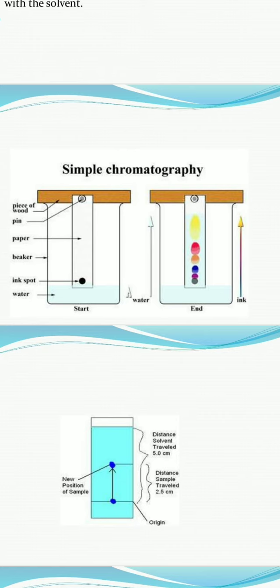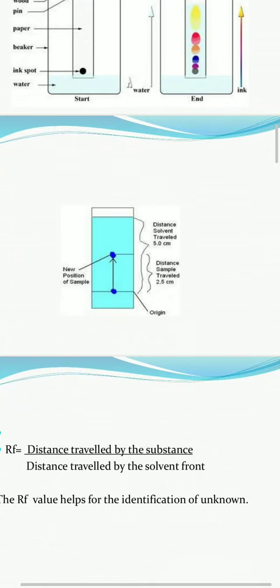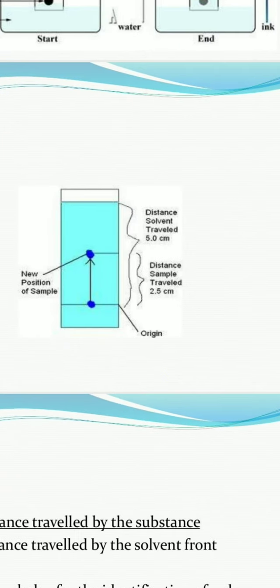The mobile phase travels through capillary action, and on this basis the sample containing the mixture in this spot travels upward through capillary action.